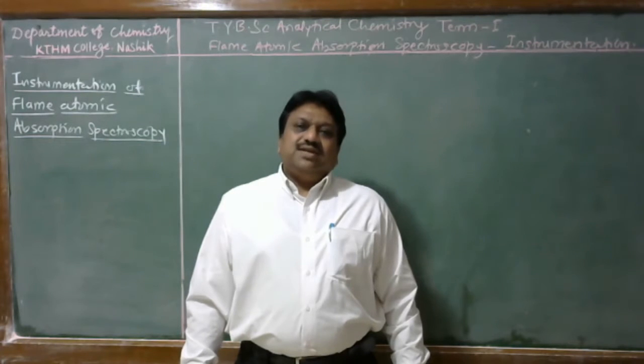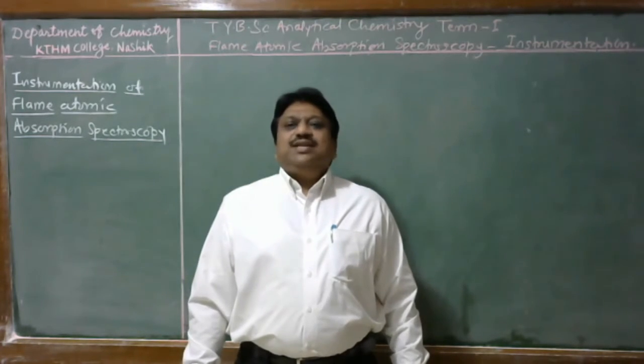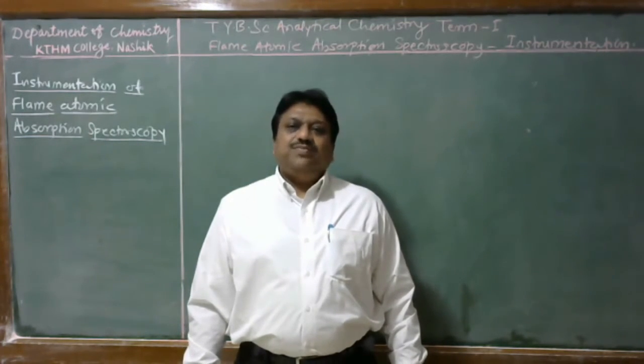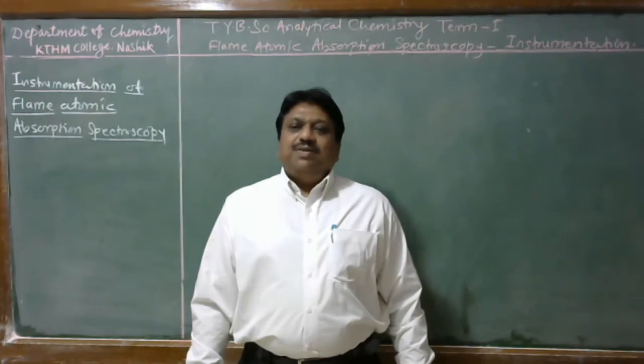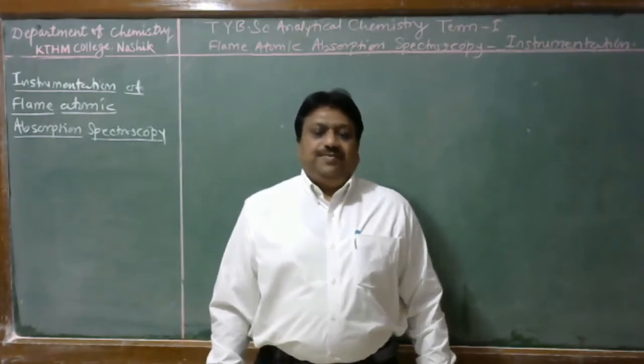Students, today we discuss how the instrument is constructed for measurement of the absorbance of gaseous state atoms, that is the instrumentation of flame atomic absorption spectroscopy.